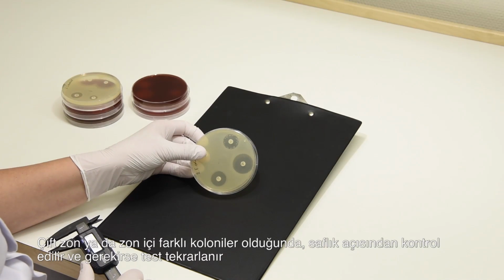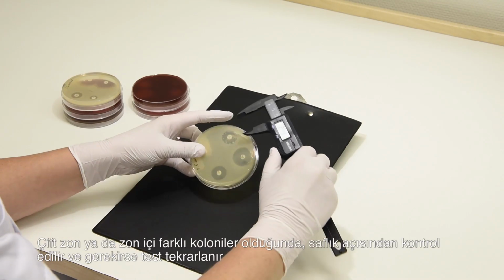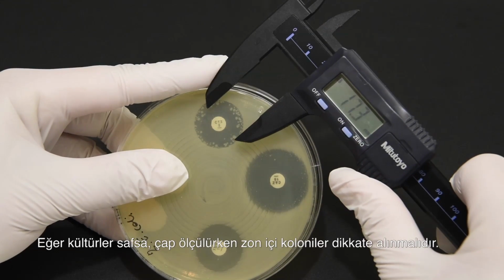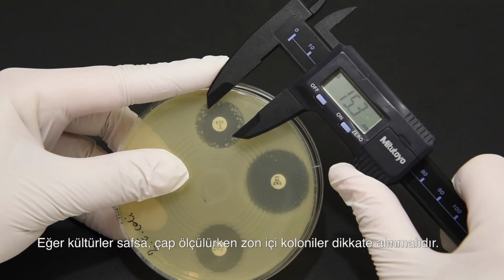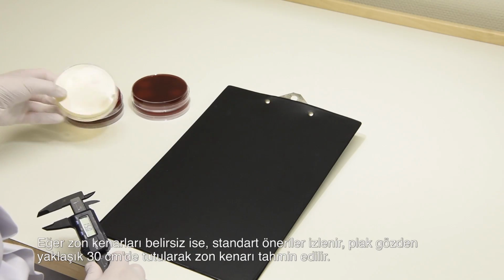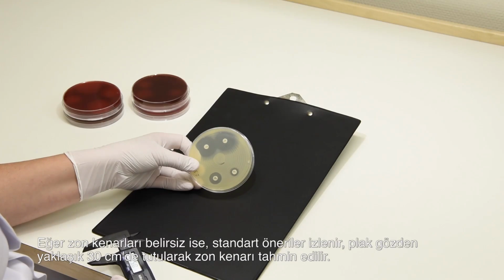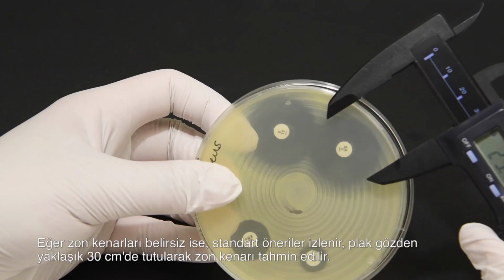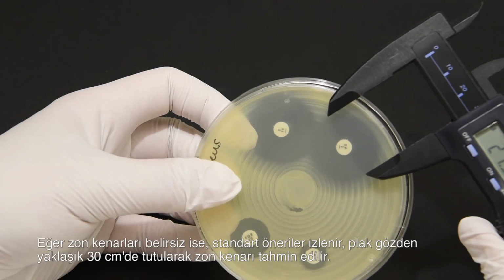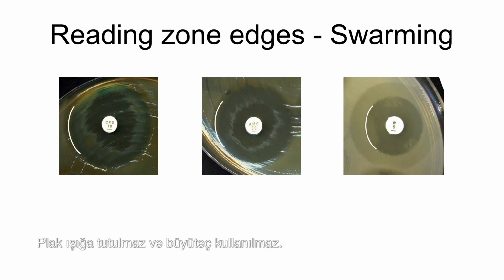lid removed. In case of double zones or distinct colonies within zones, check for purity and repeat the test if necessary. If cultures are pure, colonies within zones should be taken into account when measuring the diameter. If zone edges are fuzzy, follow the standard instructions, namely, hold the plate about 30 cm from the eye and estimate the zone edge. Do not hold the plate up to the light and do not use a magnifying glass.